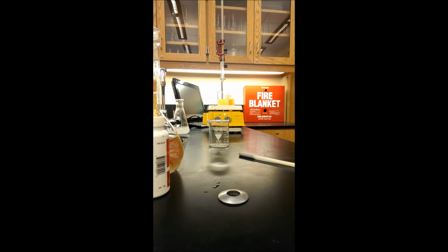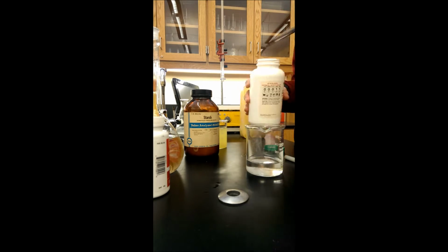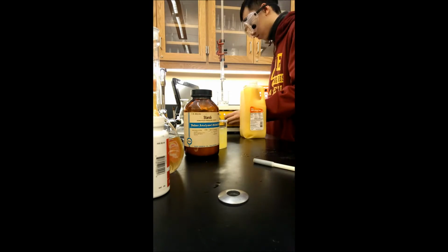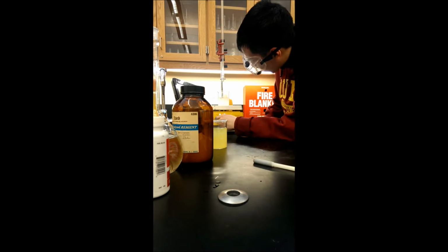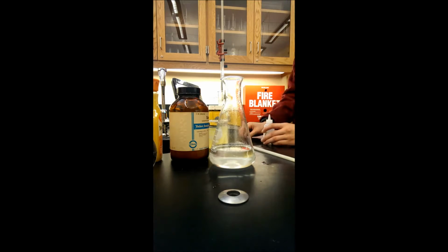So here we have the orange juice, and it didn't work, so now I'm trying out just the indicators and all that stuff to see if it works. So I put in some starch and the iodide solution, and eventually figured out that the iodide solution was the culprit.